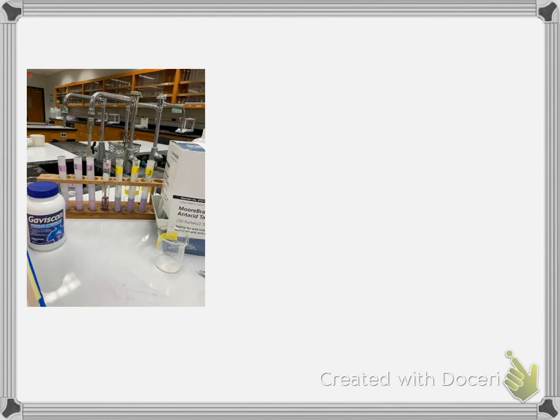Now in your data I mentioned that I would write it. So you recorded from the video the mass of one dose, the name and the quantity of the active ingredients, the mass of the beaker and the antacid sample that you started with, and the mass of the beaker and what was left after it got neutralized.